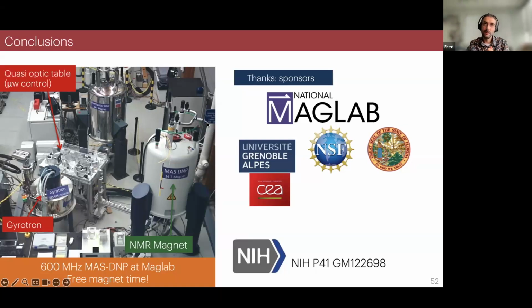If you have a weak coupling between the nitroxides, then this hyperpolarization transfer to the outer world is now more challenging because the rate at which it occurs is slower. I've not shown these details, but not so long ago I published a paper about it.